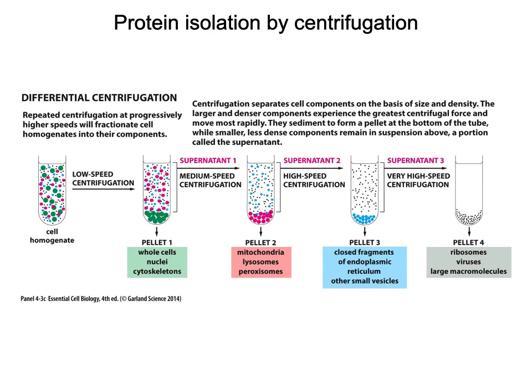Okay, so the other thing to keep in mind is that with low speed, these centrifuges are cheaper than your high speed centrifuge. A high speed centrifuge has to be able to be balanced and be able to spin fast enough in order to get that separation. And so the technology in order to do that costs more money. Okay, so most cell bio type labs are definitely going to have a low speed and mid speed. Usually your high speed centrifuge is shared equipment in a lab space.